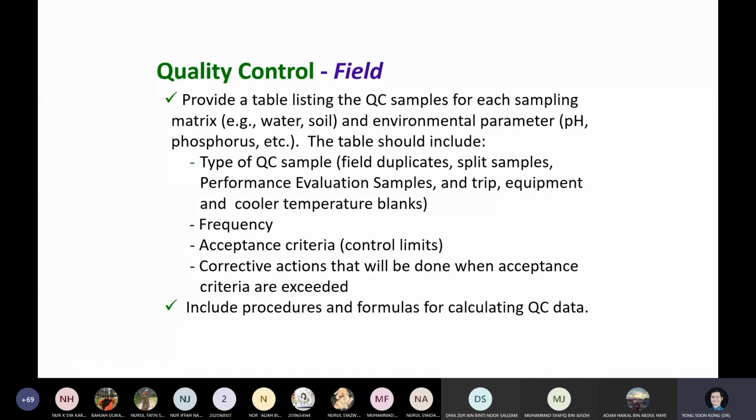Things might happen when you go and sample that do not turn out as you expected, for example the concentration is lower than expected. Then what are the countermeasures you need to take? Do you dilute, or do you change the QC? And from the QC, can you actually measure the so-called sensitivity? QC samples can help you measure the variation and also the detection limit of a method.